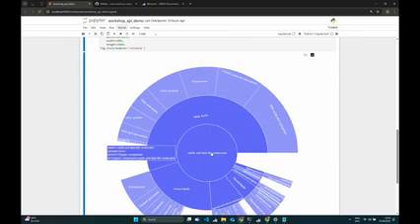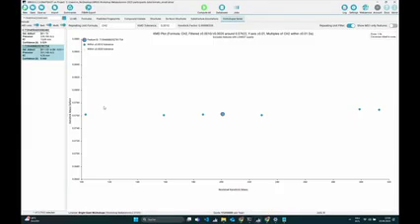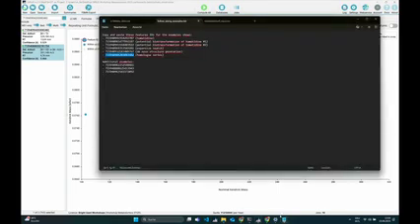This might give you just a basic overview, and of course you can do much more with this. Maybe this API is also much more interesting if you want to do some manipulations. What you can do in the API is also delete something, for example, so you can manipulate everything. You can do a lot of what you can do in the GUI with the API. Okay, now I actually have quite a bit more time, so I can also look at some additional examples.